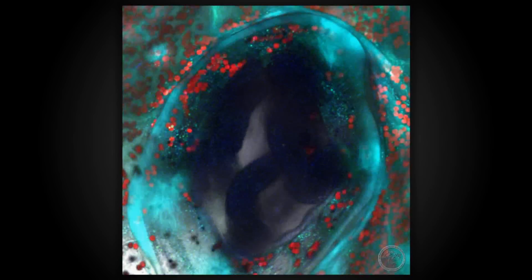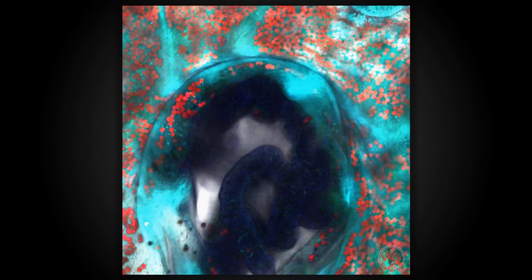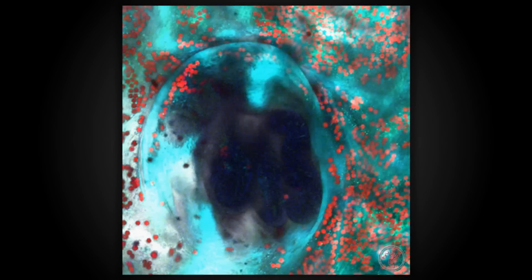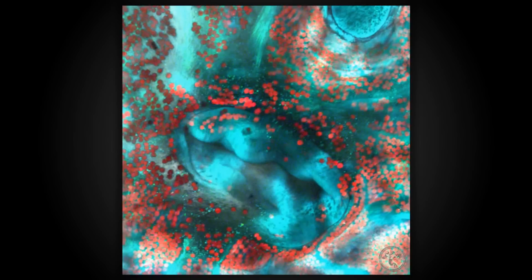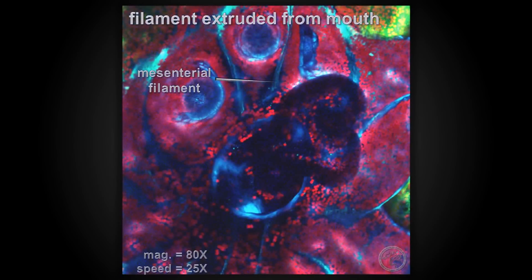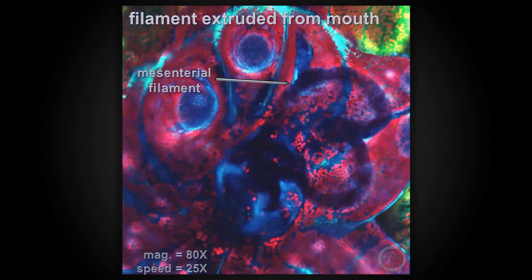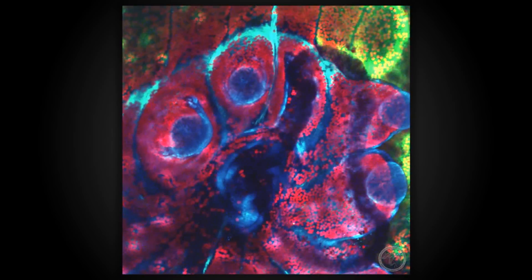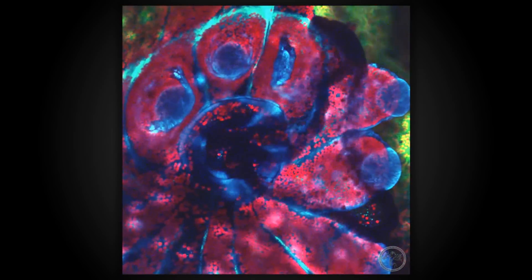As docile as coral may appear, they are actually very dynamic. Aside from moving tentacles, they can extend mesenterial filaments from their mouths. In this image, combining fluorescence and transmitted light, you can see the mesenterial filaments moving inside the mouth of this polyp. Corals use the extrusion of mesenterial filaments to battle with neighboring coral, to catch prey, or in this case, to expel symbiodinium.